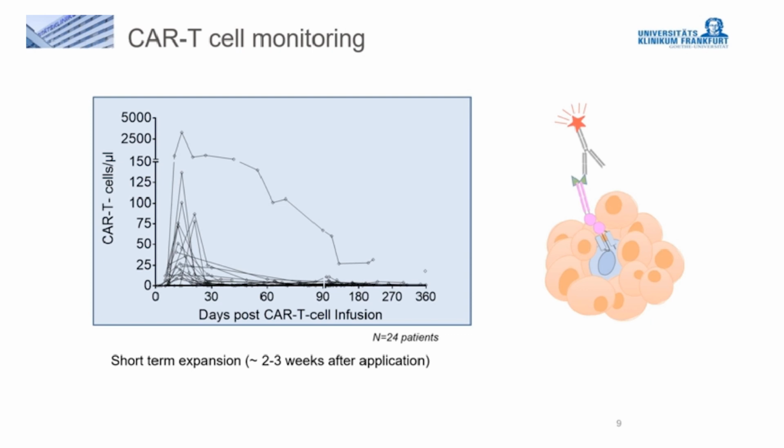So you can ask, why monitoring CAR T cells so closely? There are publications who showed that a high expansion of CAR T cells is correlated with a better outcome in these patients. And of course, a longer persistence speaks for controlling the blasts over a longer period of time. And one major advantage of monitoring by flow cytometry is that you can differentiate the cells in more detail. And so I come to my next slide.